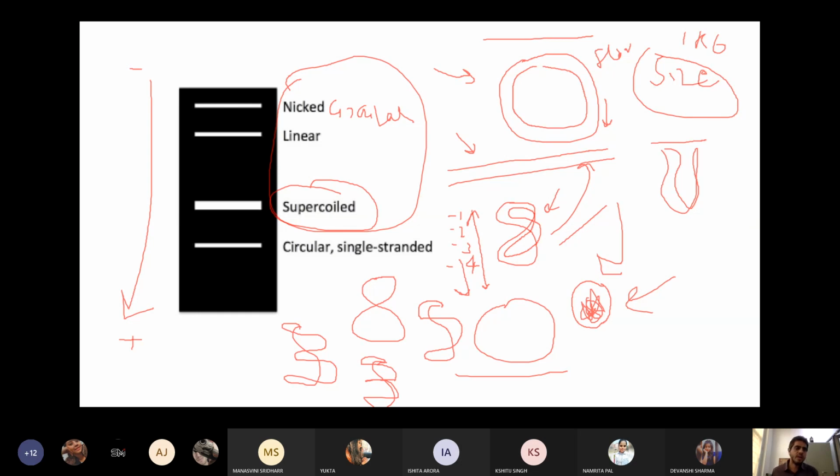Okay, so as we know, when we have plasmid DNA in cells, in which it is naturally occurring, as you all know, many bacteria have naturally occurring plasmids, for example Streptococcus pneumoniae, in which you studied the rough and smooth strains.